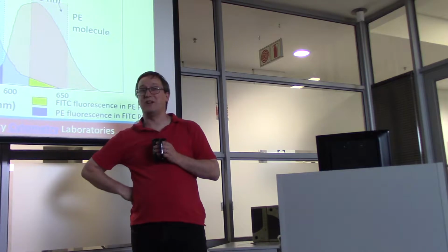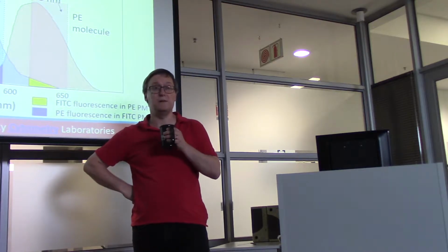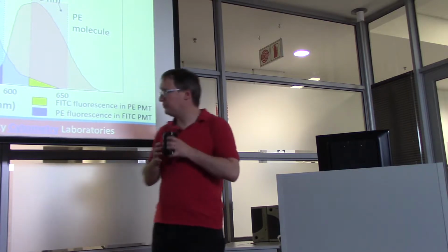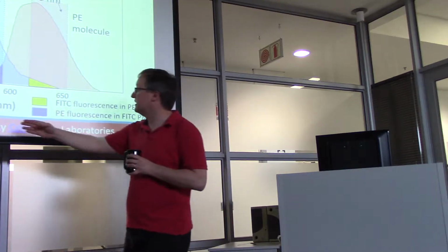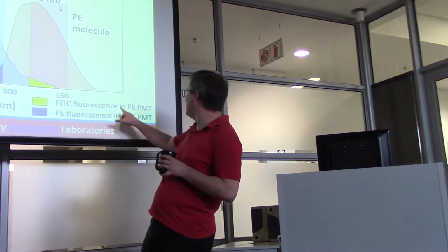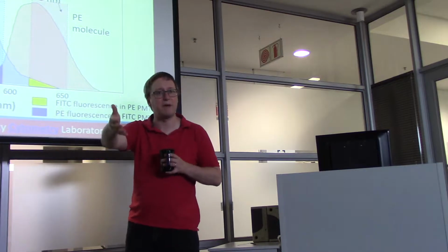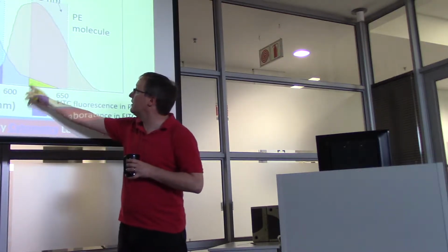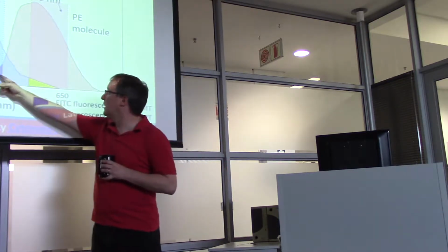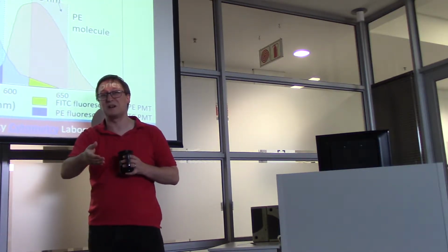Now, the situation becomes a whole lot messier when we're thinking about multiple dyes in the same sample. This is a theme that's going to show up pretty strongly in a concept that we call compensation. Okay, so remember our friend fluorescence, he's right here again. So we are now looking at the fluorescent intensity of the emission spectrum, I believe. So we're looking at the light that is received back from these, and we see that when we look at multiple dyes in operation within the same sample, the emission bandwidth of the emission spectrum of one may overlap with the emission spectrum of the other.